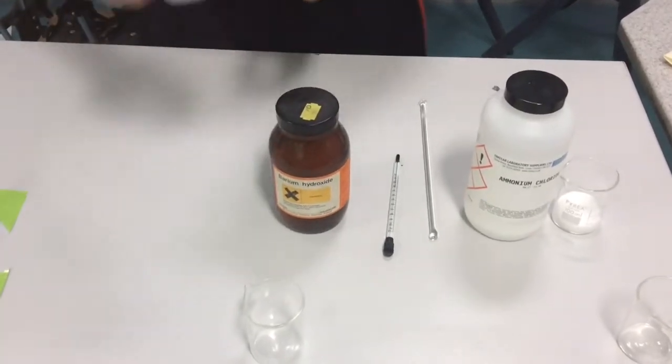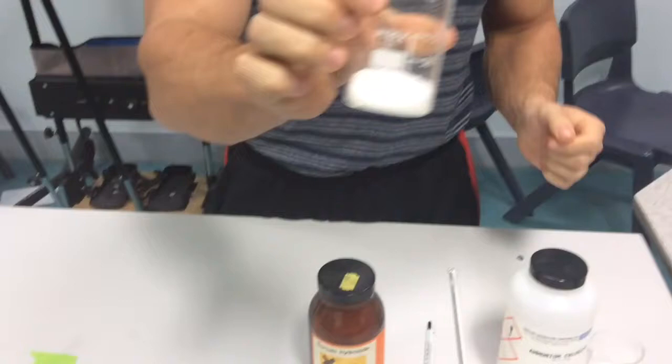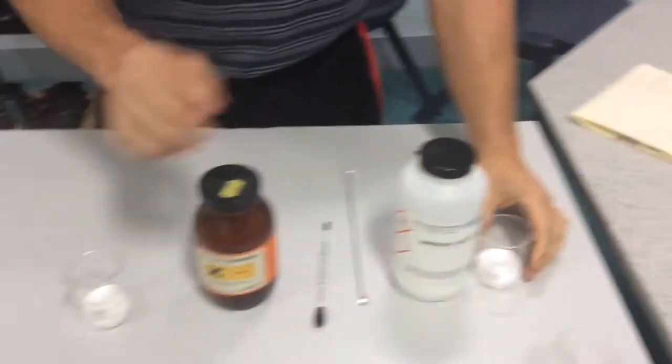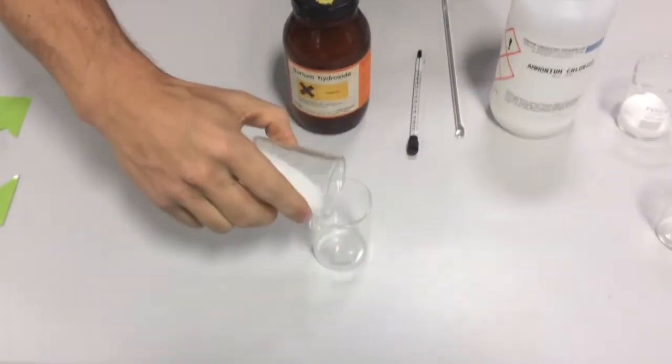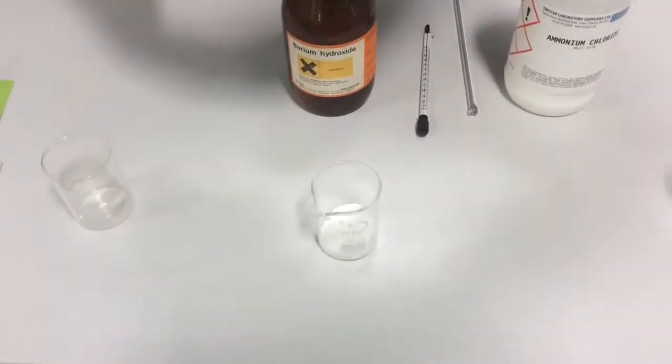Now what I've got here is 25 grams of this chemical and 25 grams of ammonium chloride. What I'm going to do is pop those in there. So put those in there, pop that in there.